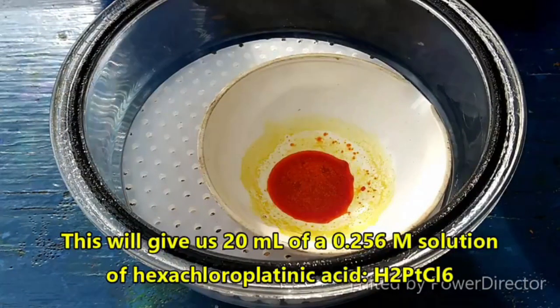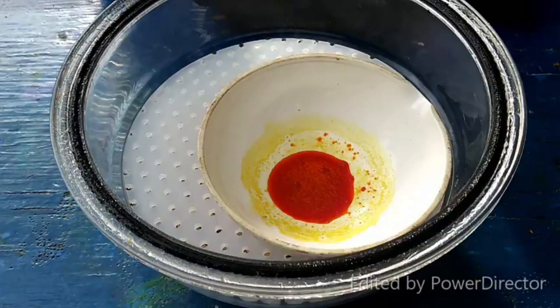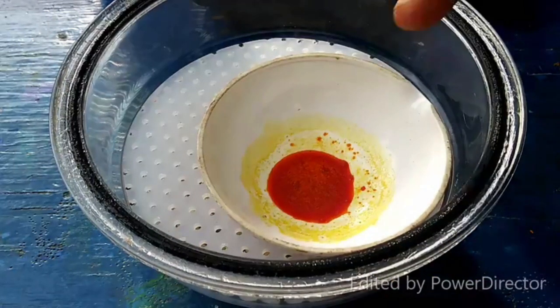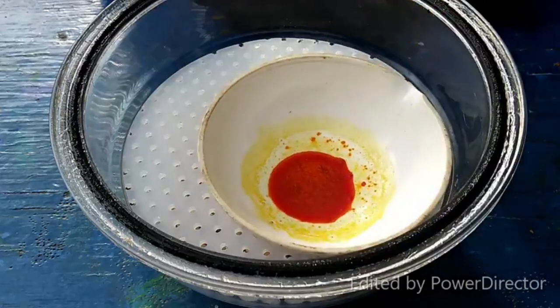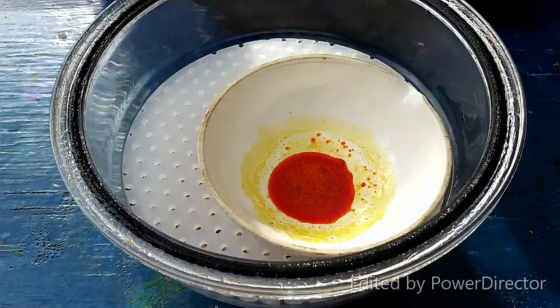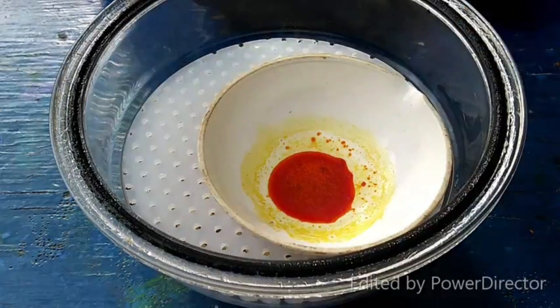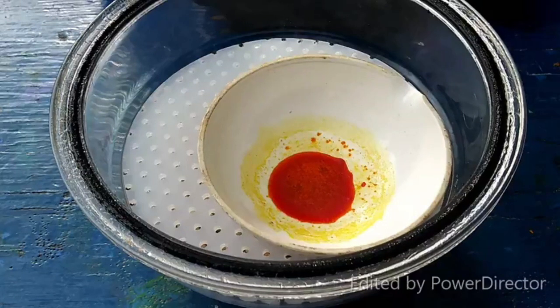I'm then going to break up that solution into portions, and we are going to do different reactions with the portions of the solution in order to produce different compounds. Again, my very ambitious plan is for us to produce 8 of them, counting this one. Even though I didn't show you how it was made, because you would have died of boredom from the tediousness of it, it's pretty self-explanatory. But this is what you get when you do that, which is, to the best of my knowledge, pure hexachloroplatinic acid. It's pretty hygroscopic.